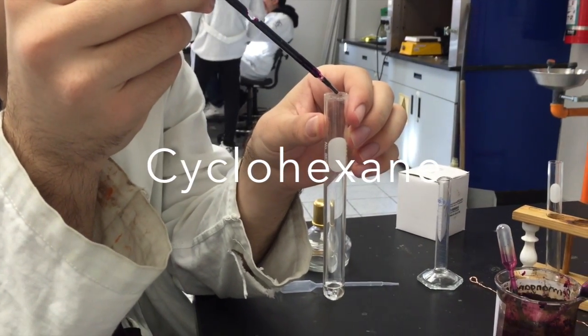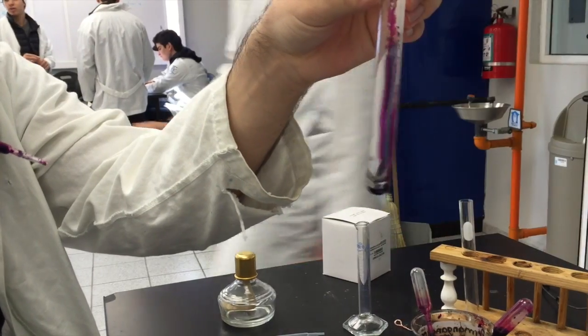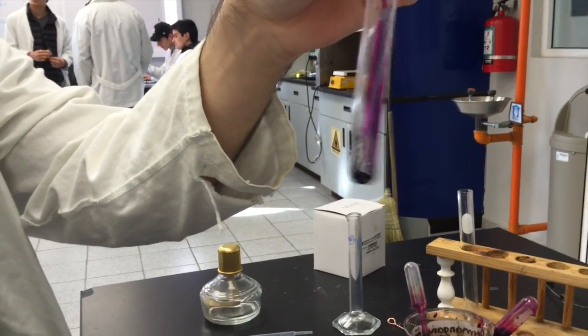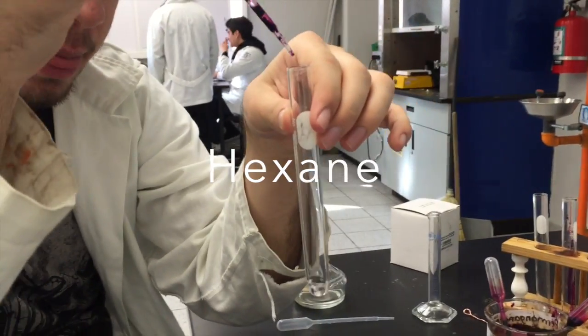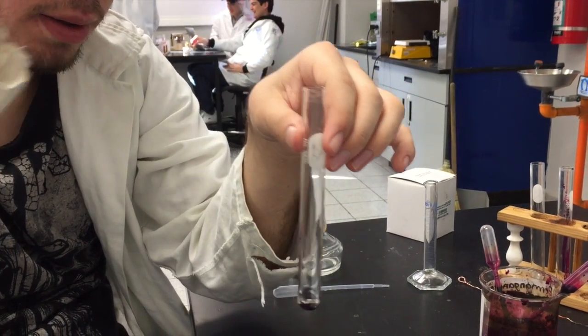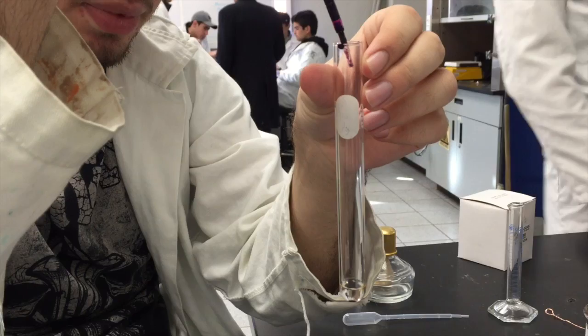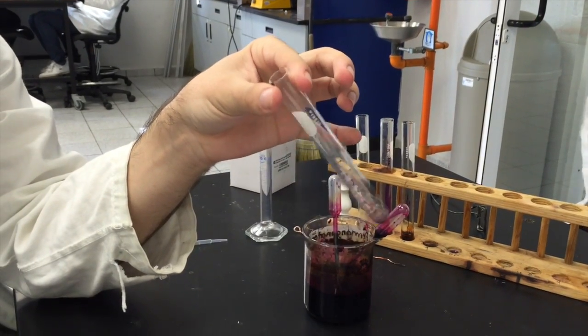Next, we did the Bayer test, in which we added potassium permanganate to each substance and observed how they reacted. The substances could either not mix at all, they could mix very well and change color, they could mix sort of well and then separate over time and change color, or they could just stay purple, which is the potassium permanganate color. We observed that turpentine stayed the same color and it didn't mix at all. Hexane mixed perfectly and turned brown. Cyclohexane mixed well but separated over time and stayed the original color.